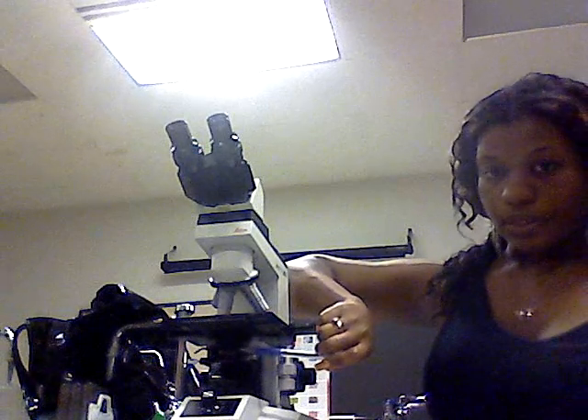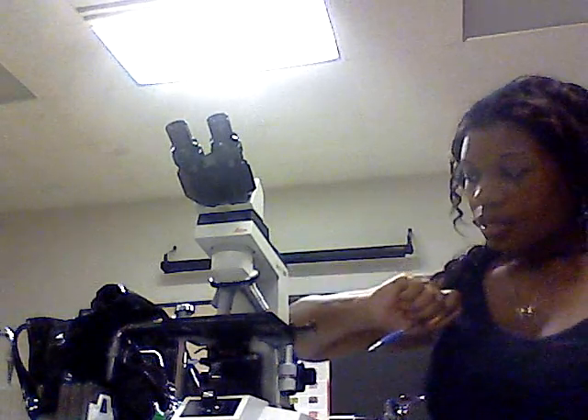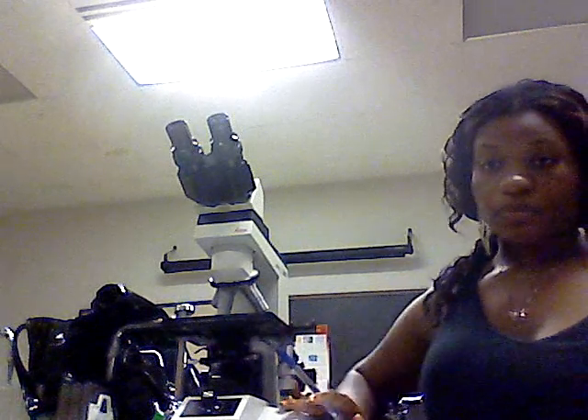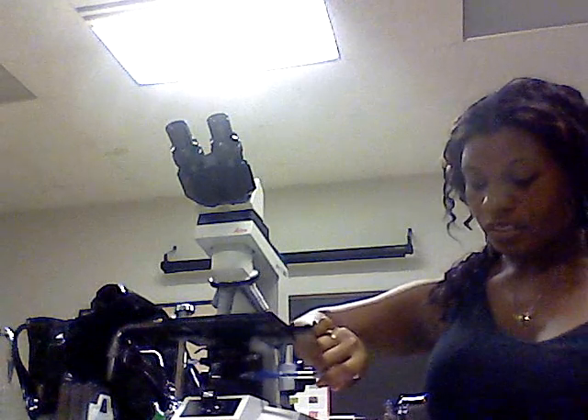The diaphragm is right here — this is the diaphragm. My microscope does not have an inclination joint. The light source comes from down here.